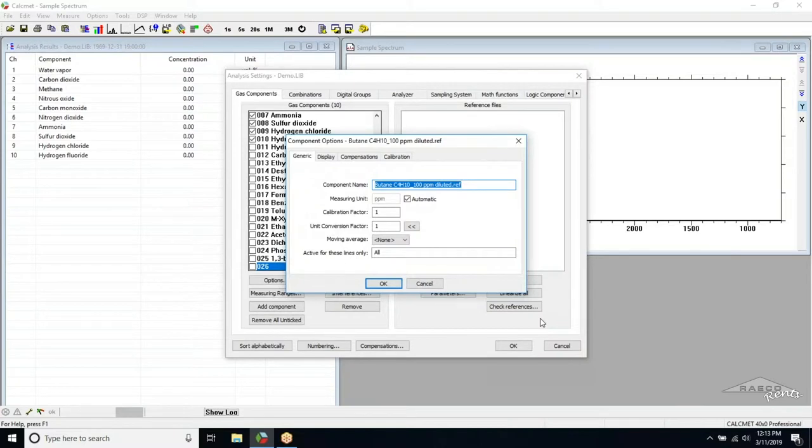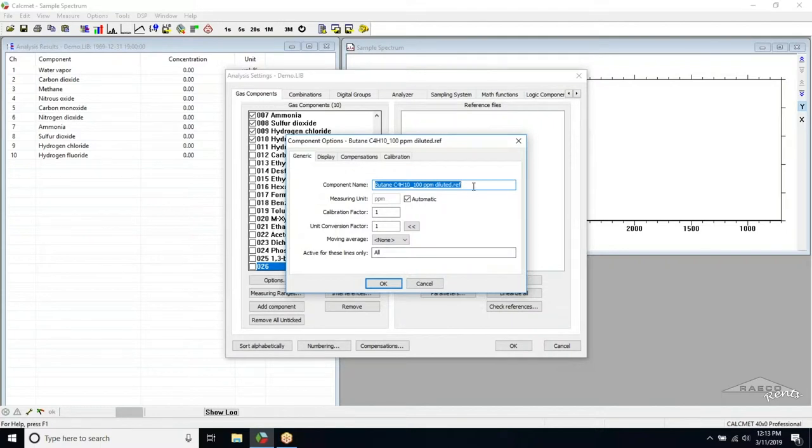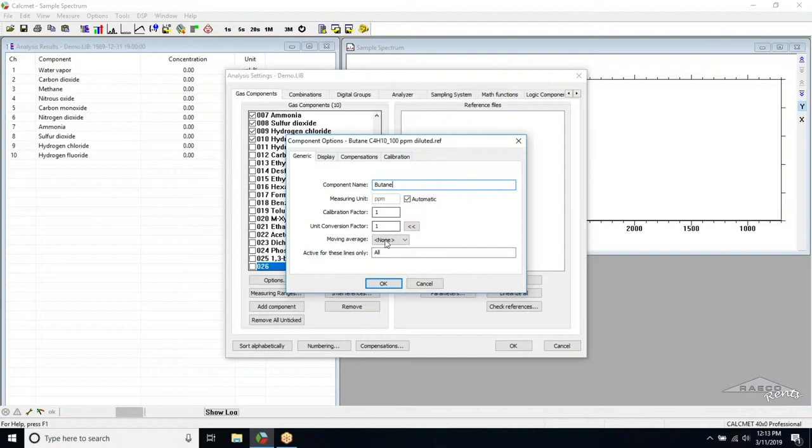This will open the Component Options window. The component name will automatically be titled with the name of a reference file, so we can simply delete the end of the title so the gas name is displayed properly. This is the only change we need to make in this window, so we can click OK and move on.